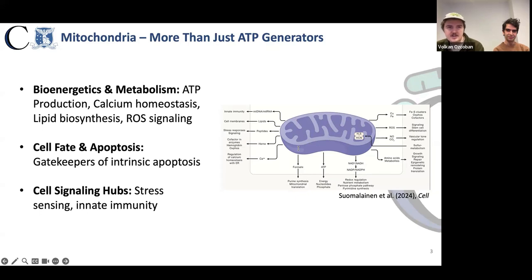A lot of existing literature in this area misses a critical point. None of this happens in a fixed static structure. It is not localized to a single mitochondria, and they change and move and interact over time. The role this project plays in this bigger picture is using image processing to extract both static and dynamic insights from mitochondrial microscopy data, and in our case, help create better models with the behaviors and properties observed.